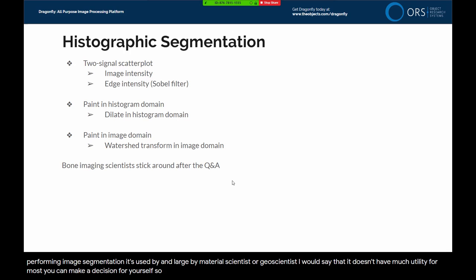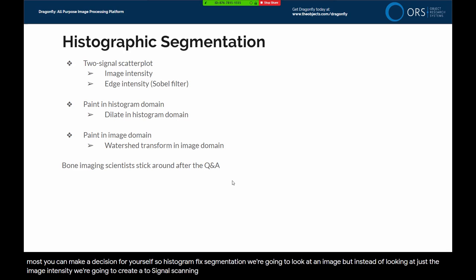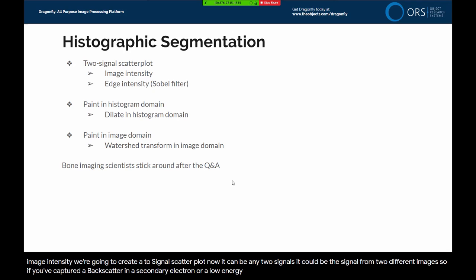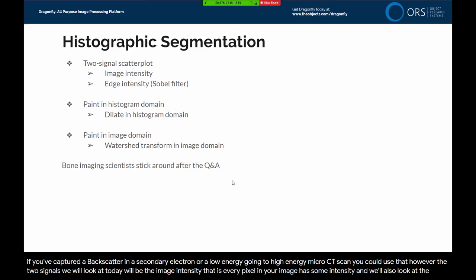With histographic segmentation, we're going to look at an image, but instead of looking at just the image intensity, we're going to create a two-signal scatter plot. It can be any two signals — the signal from two different images, such as backscatter and secondary electron, or a low energy and high energy micro CT scan. The two signals we'll look at today are the image intensity and the edge intensity — that is, the image filtered with a Sobel filter.